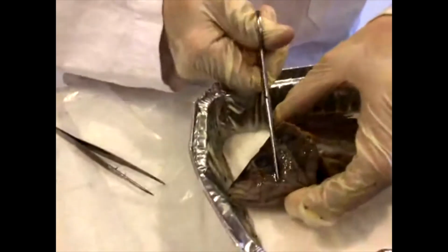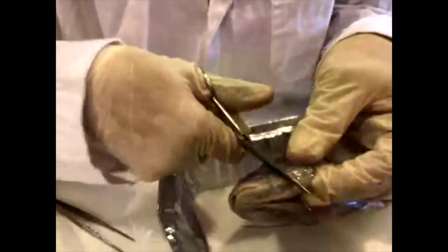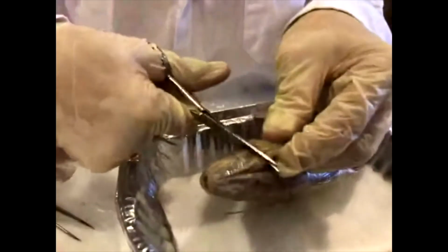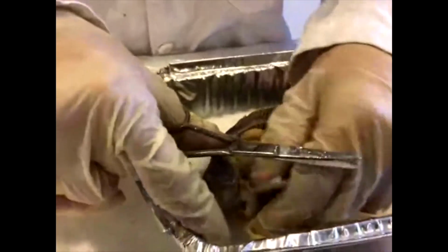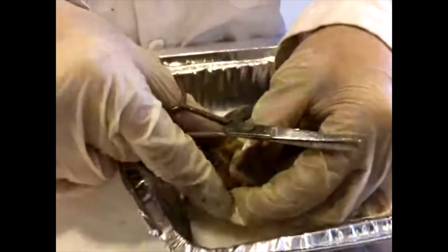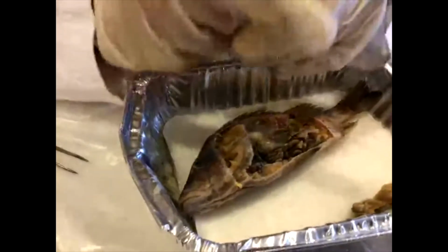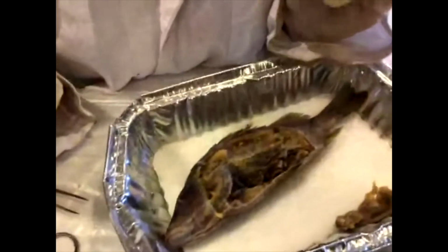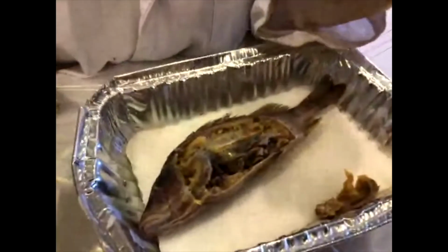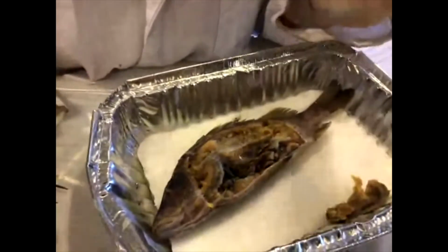Claudia asked, if the heart is so small, how can the heart pump the blood through the whole body? That is a really good question. It's a really strong muscle, and believe it or not, the perch actually has one of the bigger hearts. There's actually a lot of animals in the ocean that don't even have a heart. For example, sea stars, jellyfish, they don't really have a heart. They have what are called coelomic cavities, but really it's just open space in their body, and they don't have blood, but they have a clear liquidy substance similar to water that they just push around their body without any blood vessels, and that gets the oxygen to them.